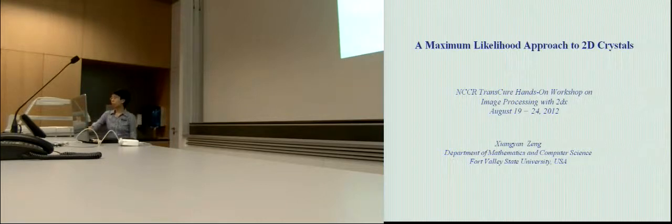to process 2D crystal images in a single processing style. And the second is to use a maximum likelihood algorithm. So today my talk is to just answer the questions why we need these two techniques.